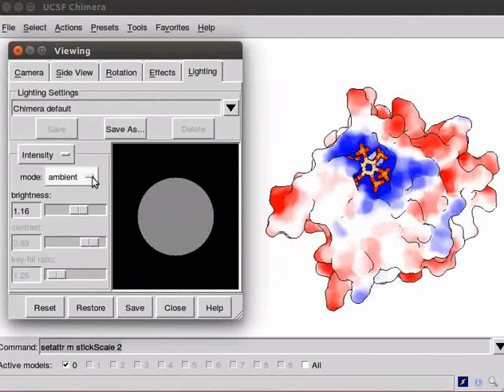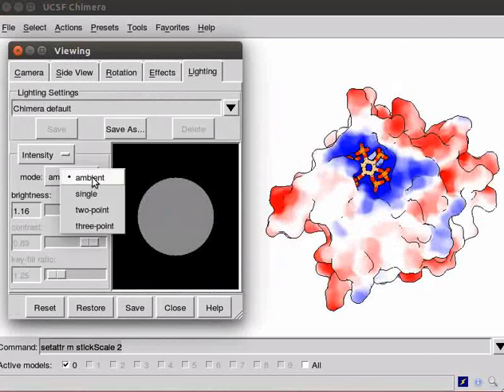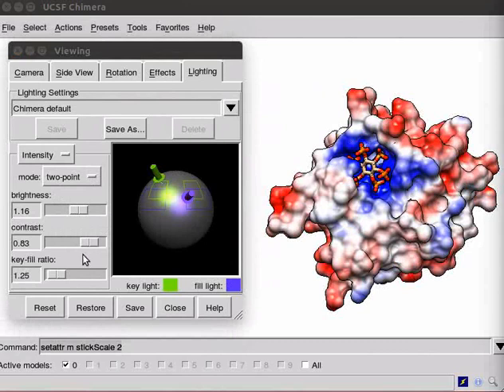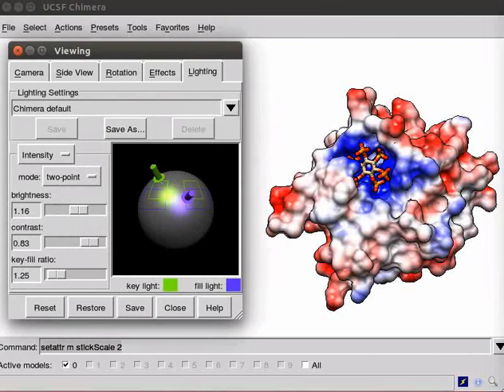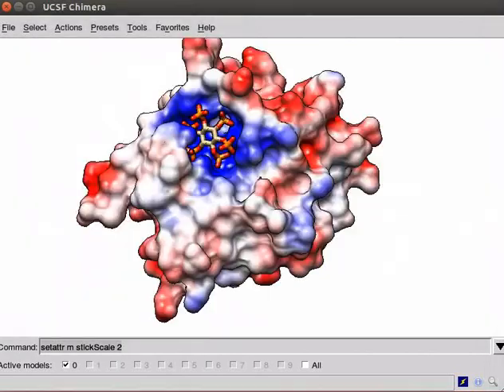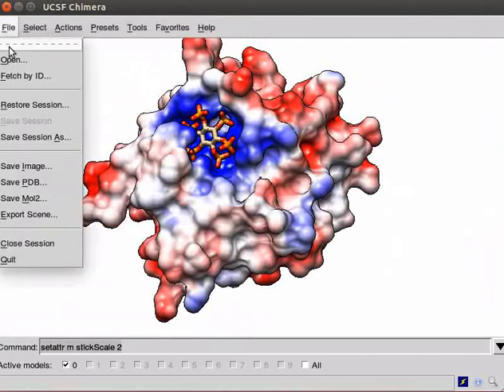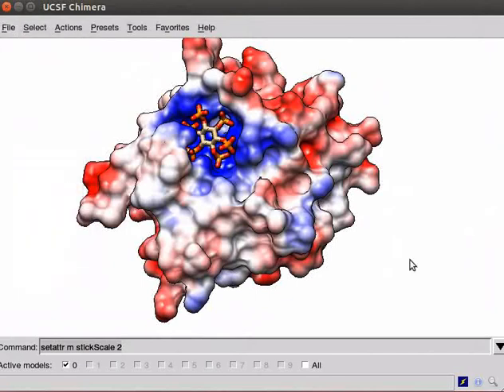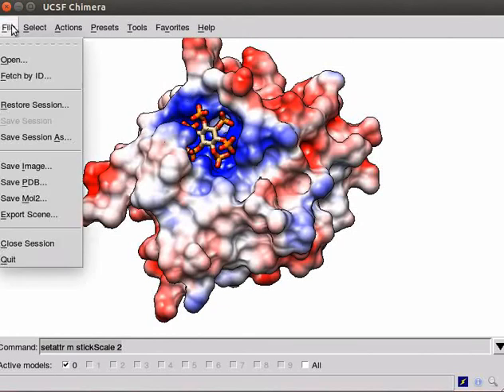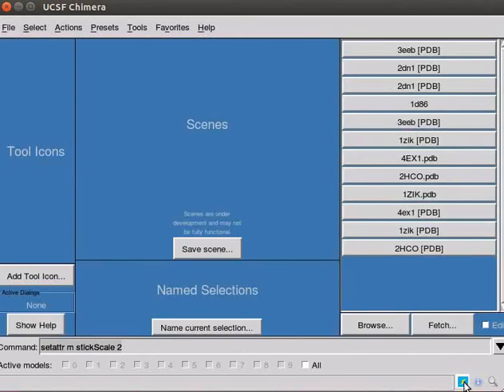Observe the panel. To restore the default lighting mode, select Two-Point option. Click on Close button to close the window. Save the image using Save Image option in the File menu. Let us now look at the surface representation for a DNA structure. Close the current session. Click on File menu. Scroll down and click on Close Session option.